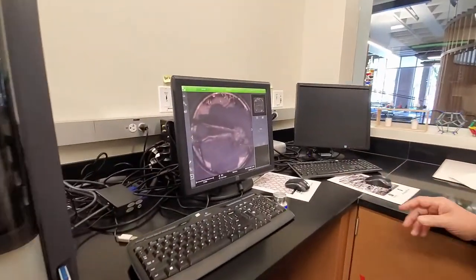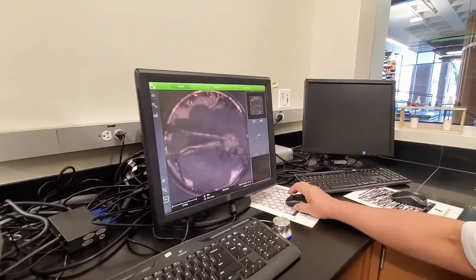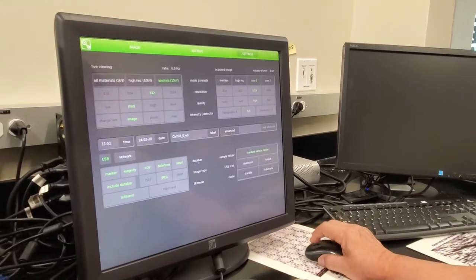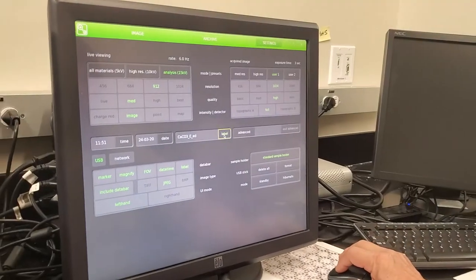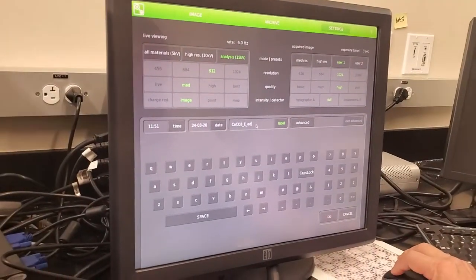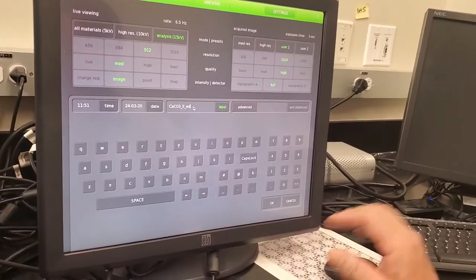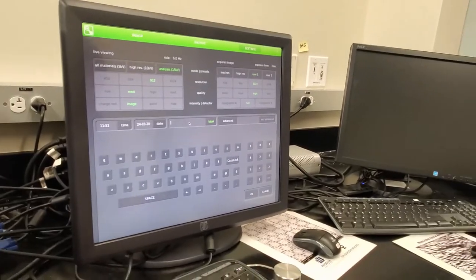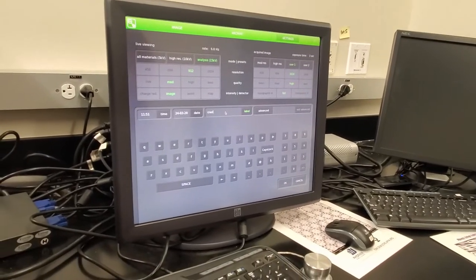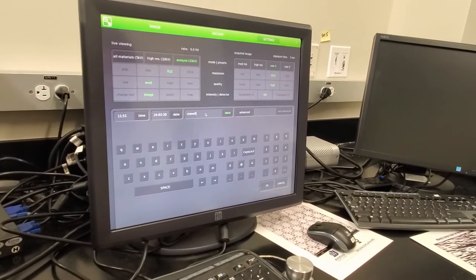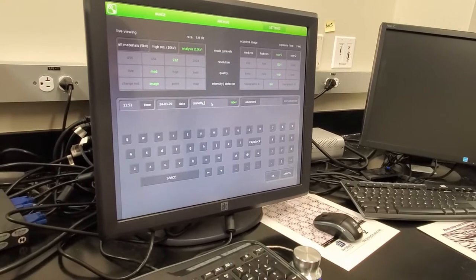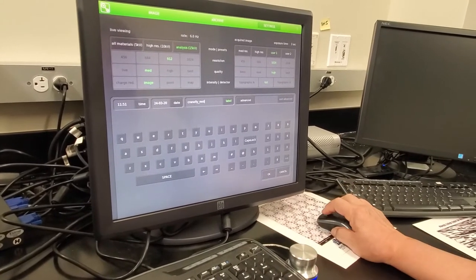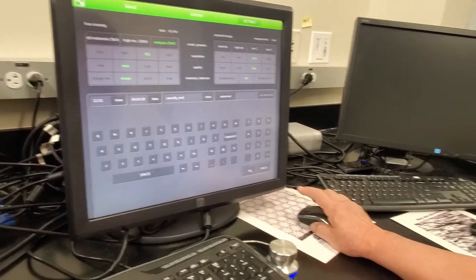First thing we want to do is go to Settings, go to Label, and what you do is label this one as crane fly. So: crane fly, and this is MNT — it's MNT — and then say OK.